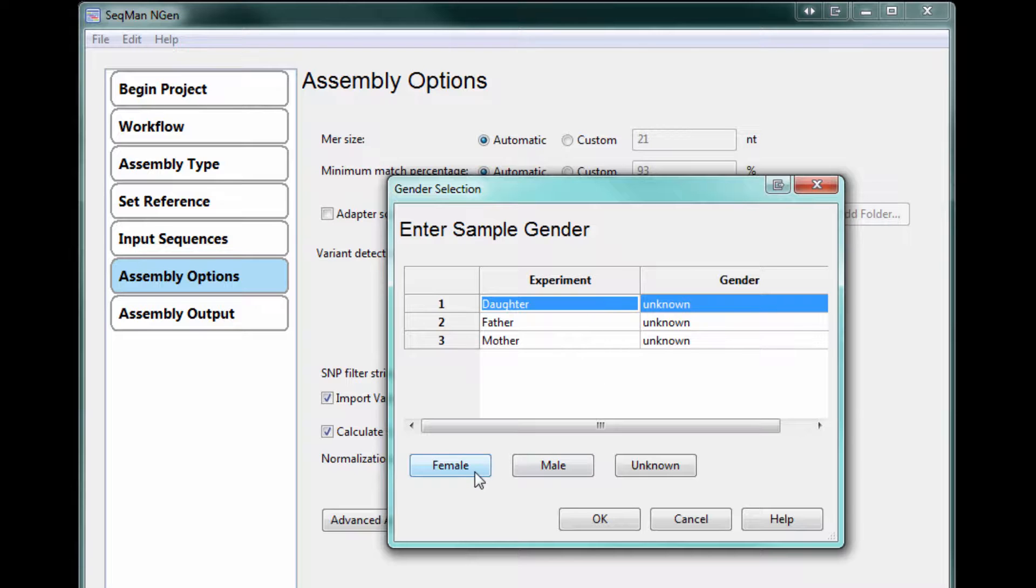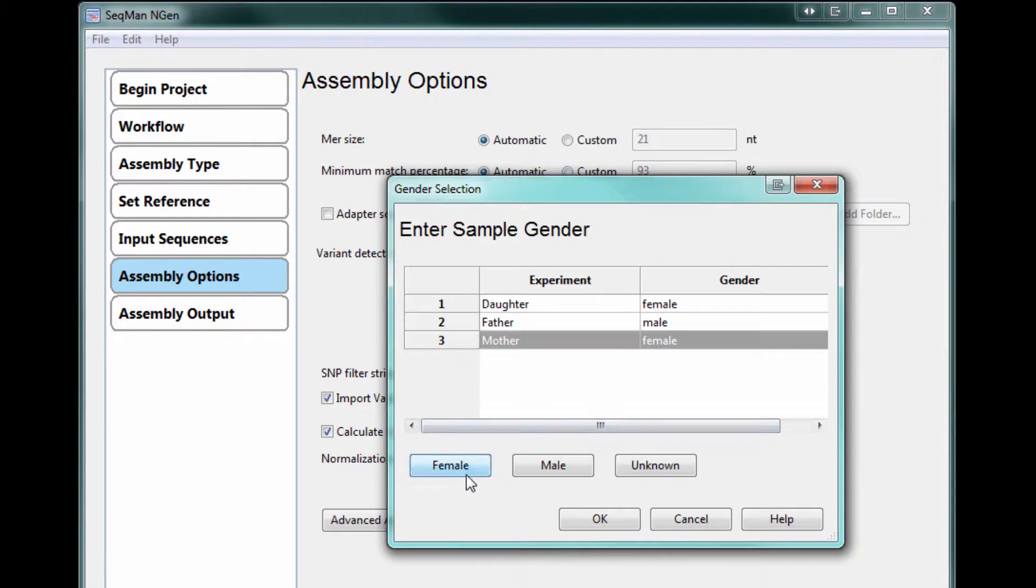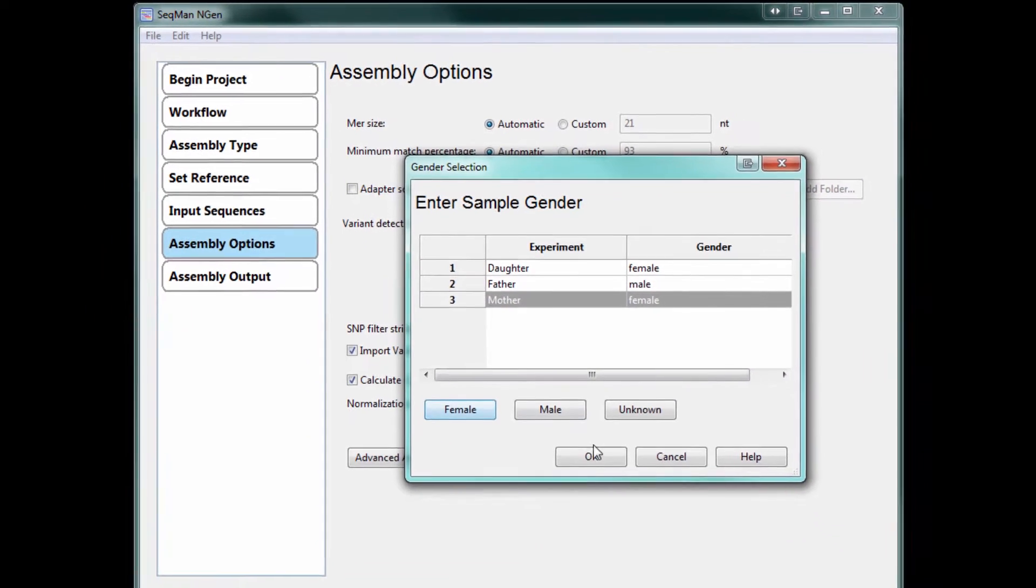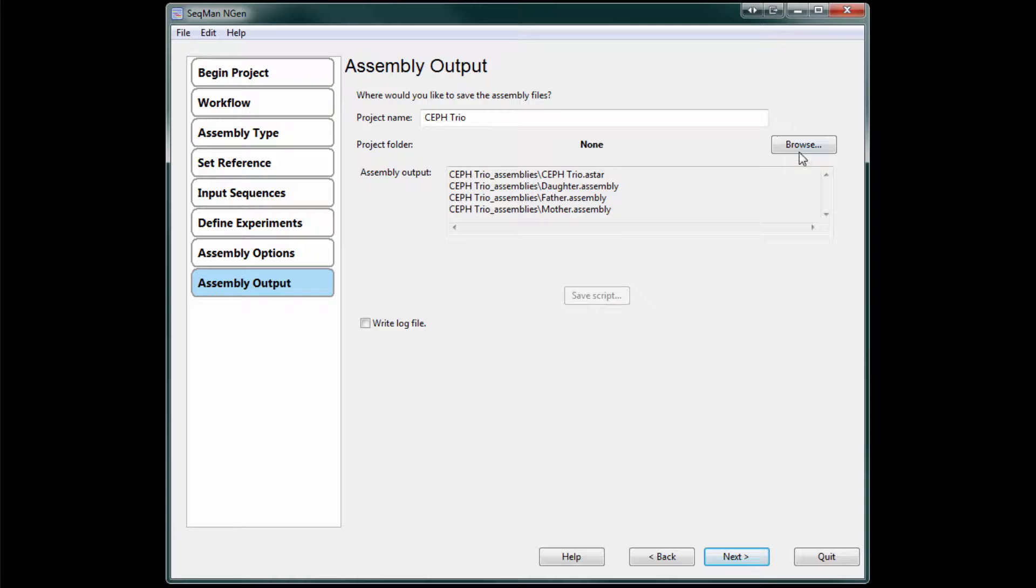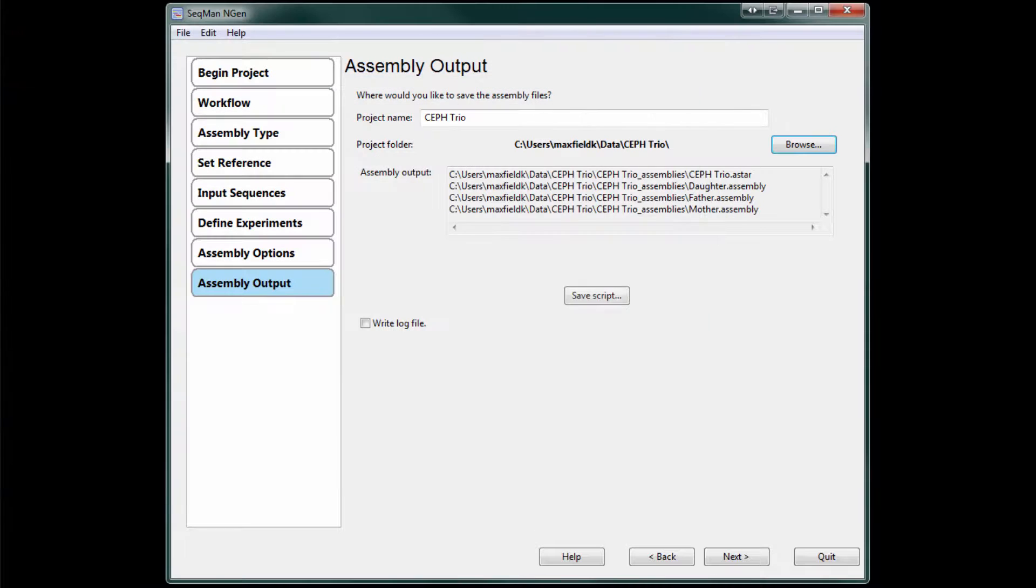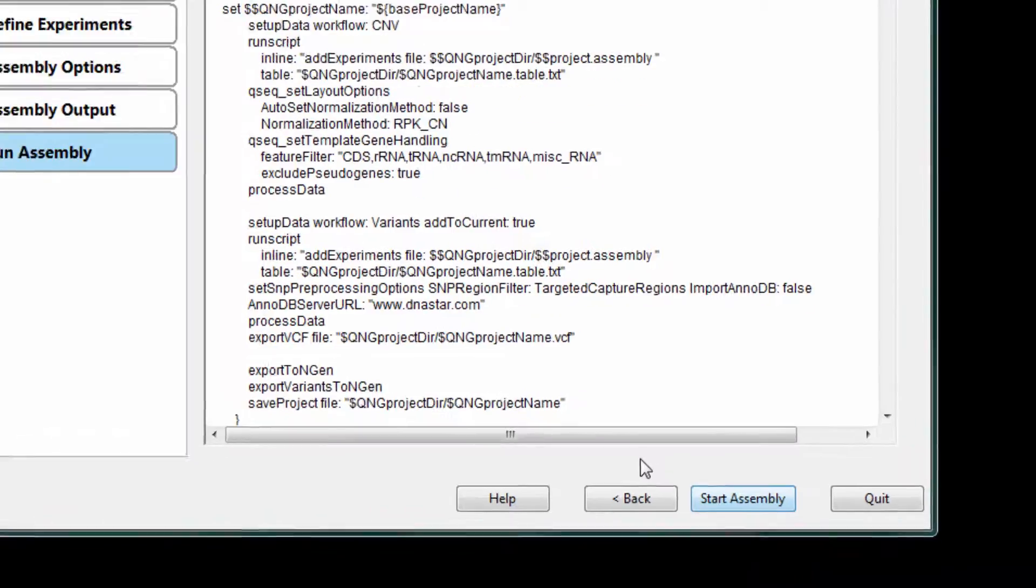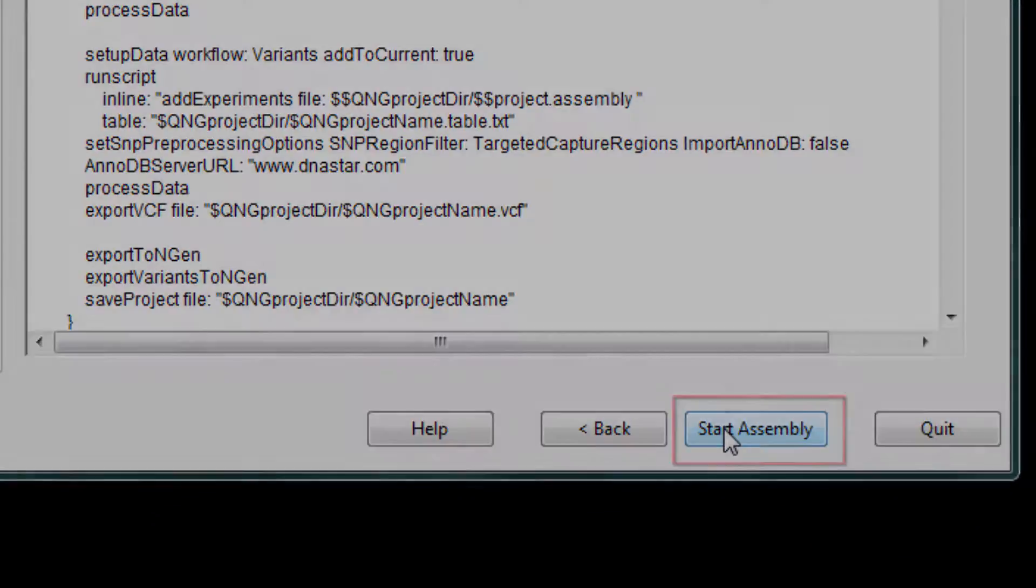Next, I need to specify the gender for each of my samples. And now we just need to name the project and specify a project folder to save the completed assembly. Then, click Start Assembly to begin aligning your reads.